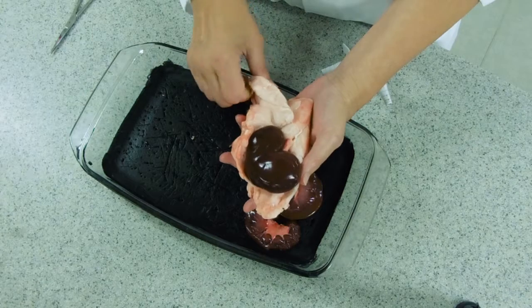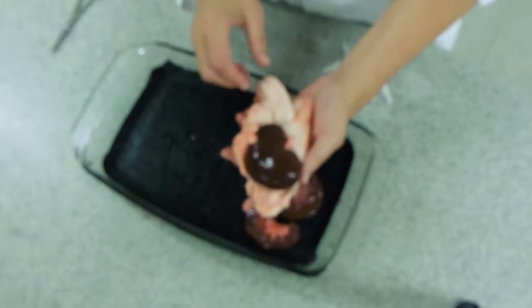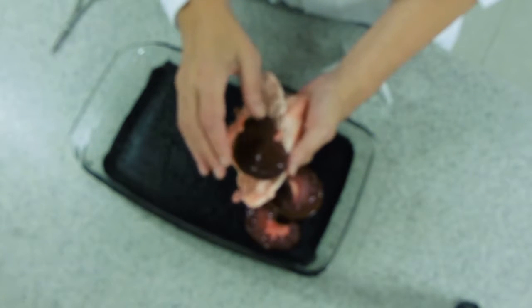Obviously this feels quite solid. It's actually fairly liquid in real life because animal fats are solid at room temperature, but of course at body temperature it tends to be a bit more slushy.